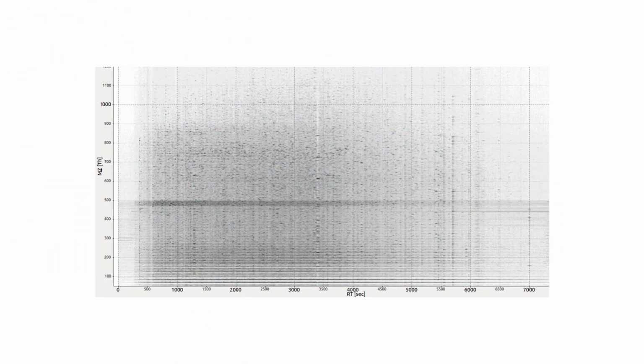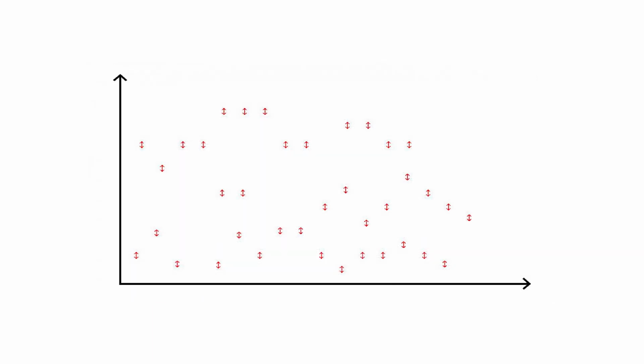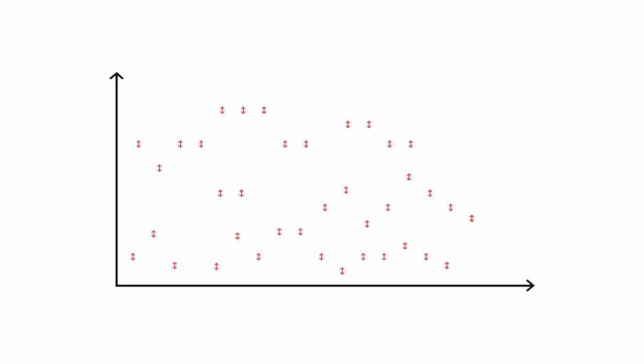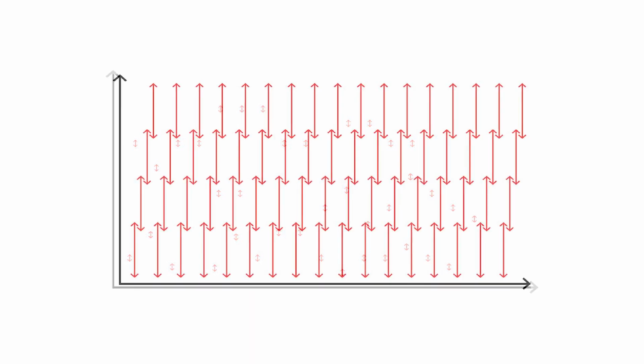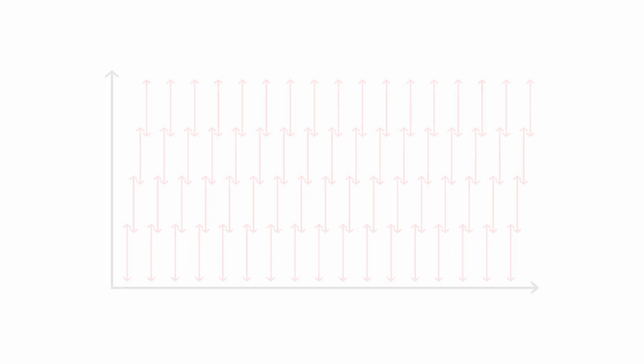We are currently working on two main pillars in mass spectrometry. And the first pillar is technology development, because we realize that the current technology in mass spectrometry still needs improvement before we can address really the large-scale questions, right? Before we can go to the type of cohort sizes that we really want to address. So we spend a fair amount of time developing new software and new experimental methods in order to increase the reproducibility and the scalability of mass spectrometric methods.